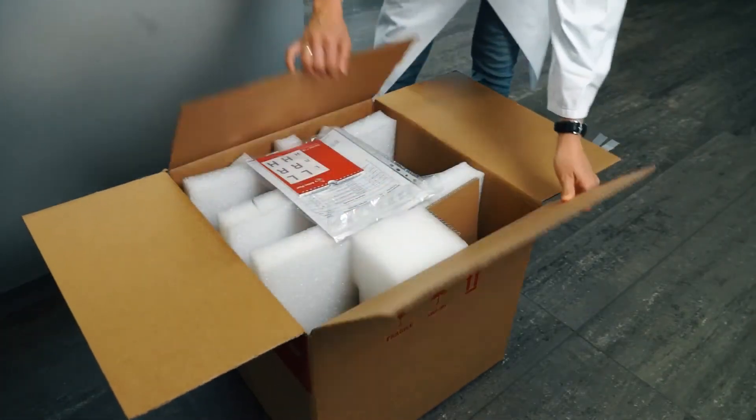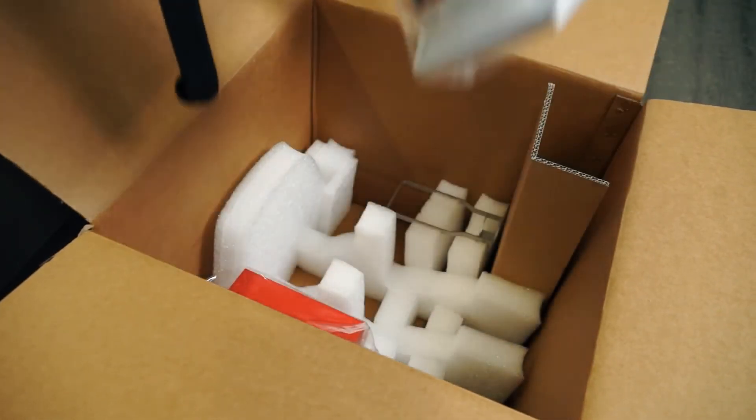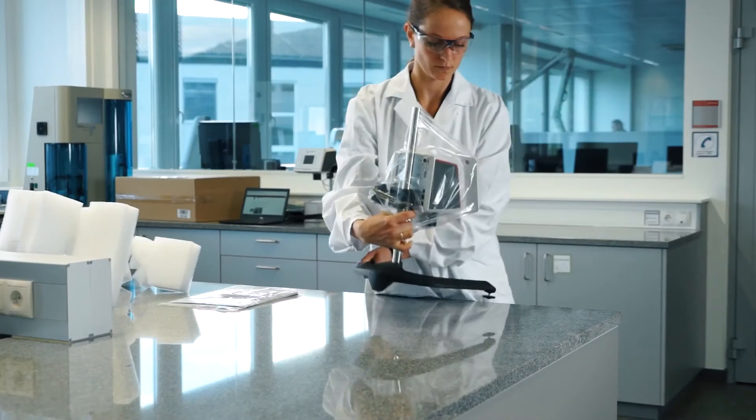Visco QC100 is Anton Paar's entry-level rotational viscometer that measures the dynamic viscosity as a single point value. Unbeatable ease of use is guaranteed right out of the box.